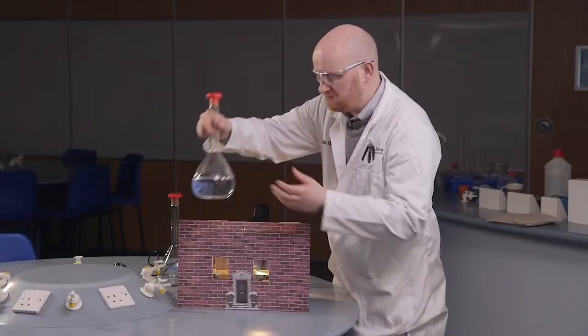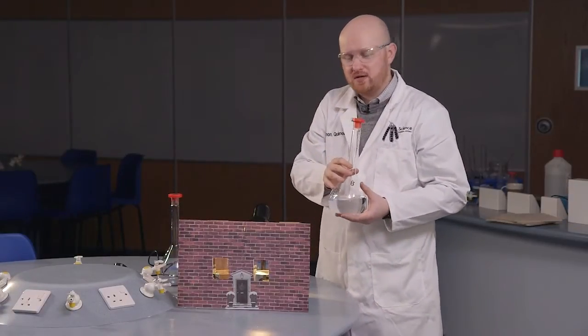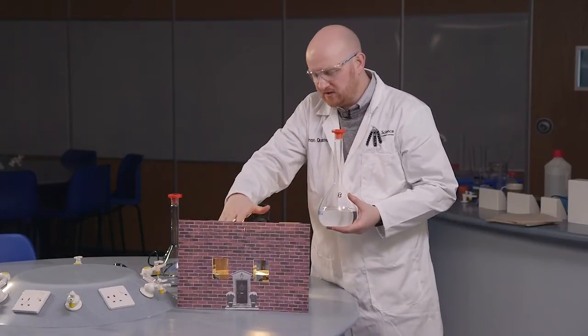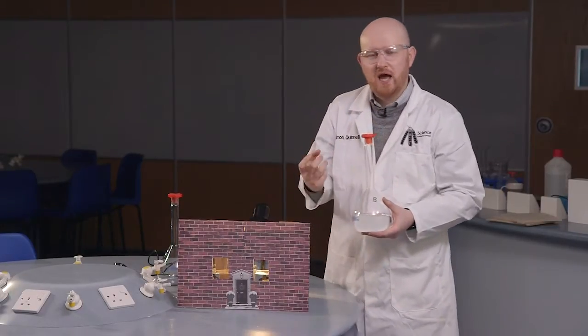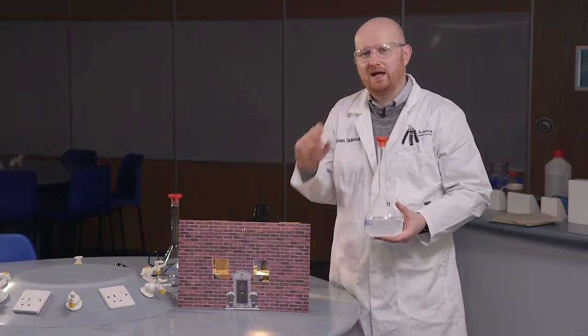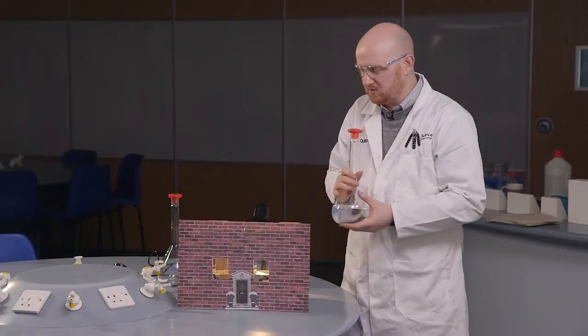Then I'm going to take solution B and I'm going to add solution B to each beaker. So we're going to fill them really to the top and what should happen, as I've said, about 10 to 20 seconds after adding this solution in, they should go dark and our lights and our curtains are drawn and our lights are switched off. So here we go.